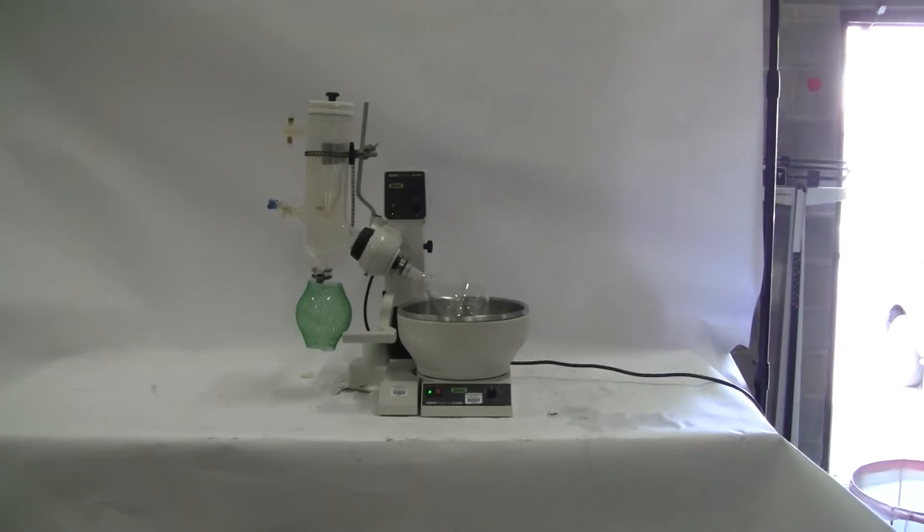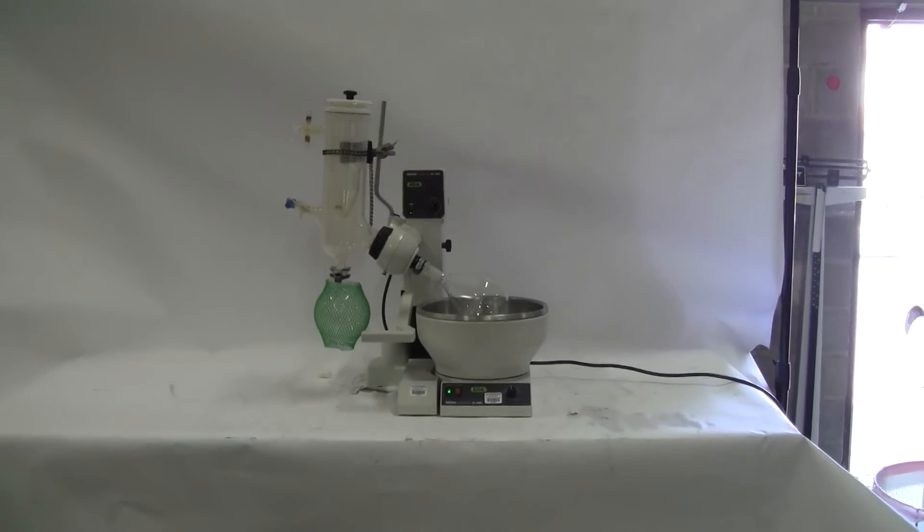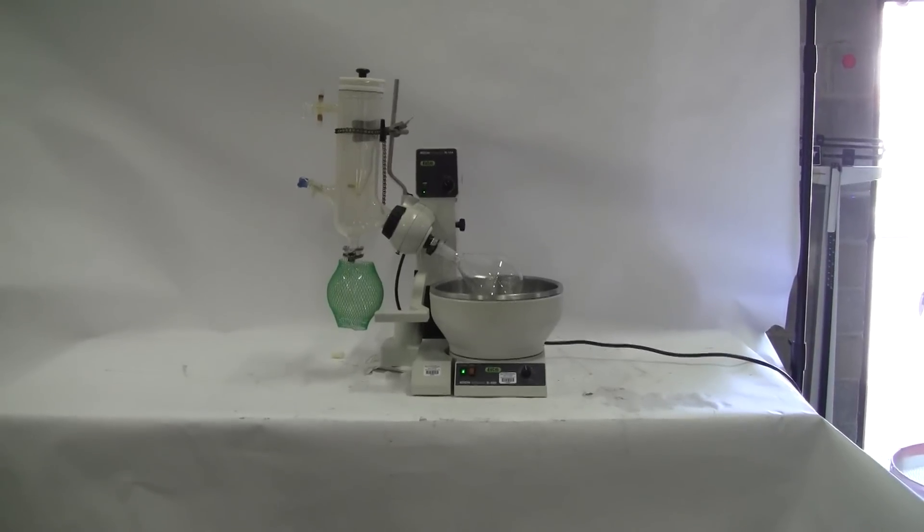Hi, this is Cody from HiTech Trader. Today we're looking at our R114 rotavapor and an accompanying water bath model 480.